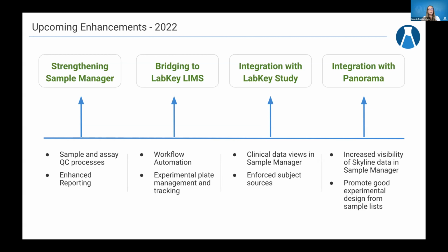We also want to continue our integration with LabKey Study. So what we did this year is only kind of the tip of the iceberg. We want to continue that integration to make it as seamless as possible, being able to provide clinical data views within Sample Manager and enforcing the subjects that are coming from the clinical data in Sample Manager as well.